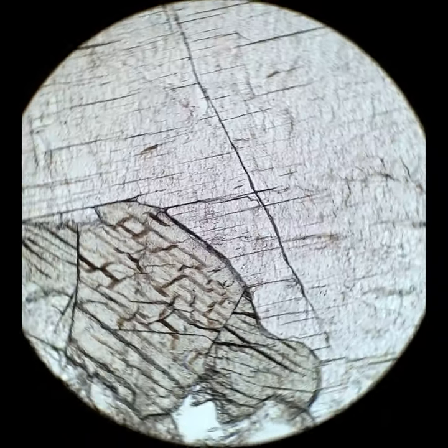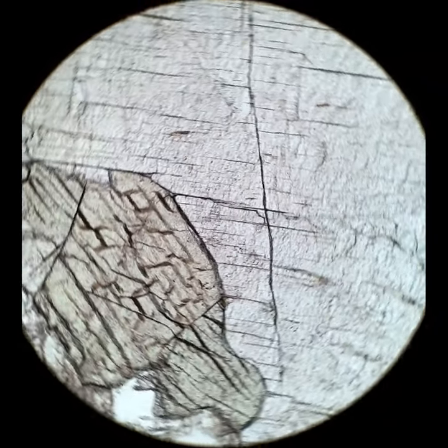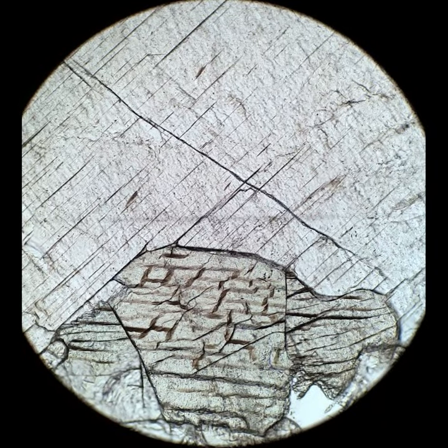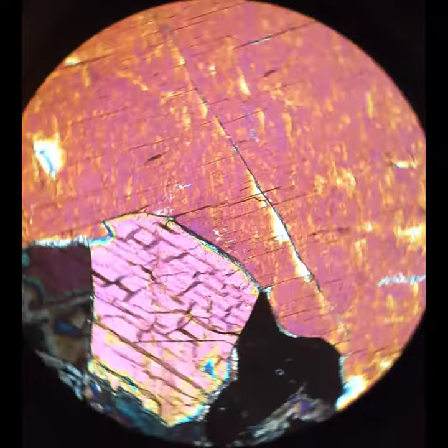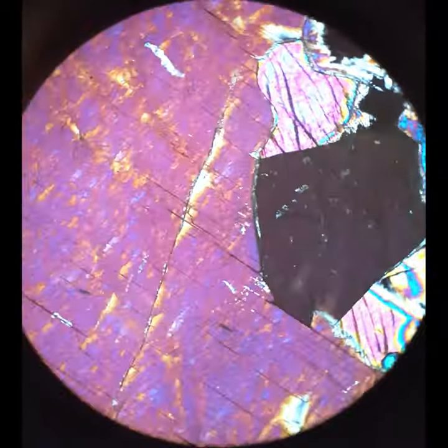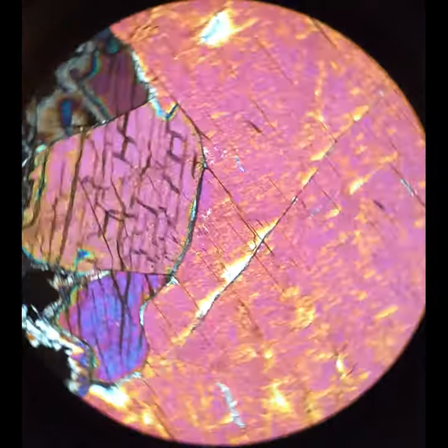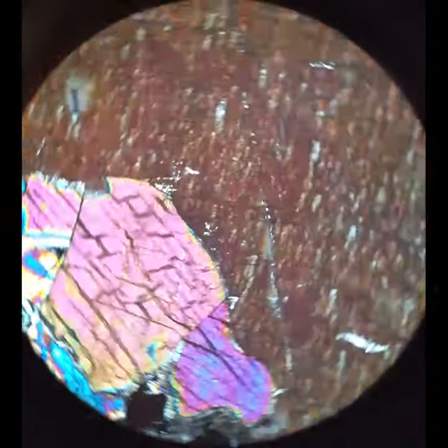Two different minerals here. The lighter colored one with the faint lines is wollastonite. The green mineral with the two dark cleavages is clinopyroxene. The clinopyroxene is at an angle so that the cleavages look like they don't intersect at 90 degrees. The wollastonite goes extinct when the cleavage is at a slight angle to the crosshairs, so it has inclined extinction.